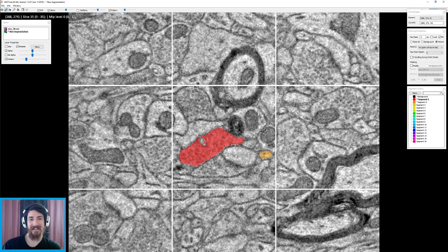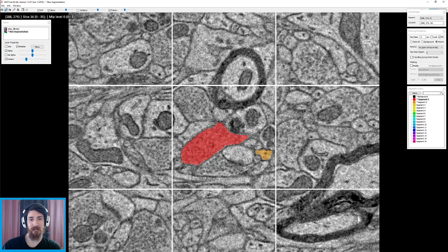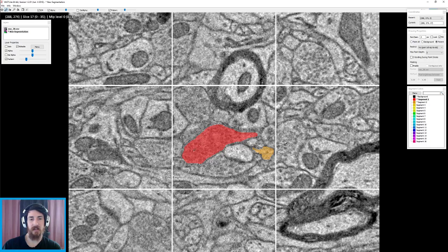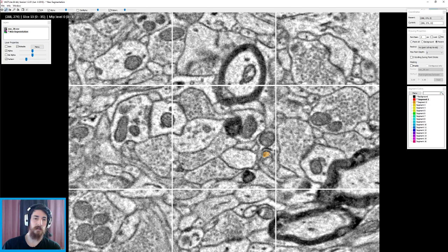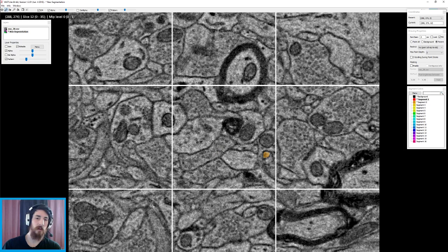Okay. Is this an invagination? I think it is. Alright. It's probably good. We want to get more data on those tough areas, which include invaginations, parallel boundaries, among other things. Membrane swirls. Looks like this membrane swirl is butting up against it, so we'll have to read the directions about how to deal with that. But I believe we're just annotating it. I'll just have to make sure that it's the correct annotation.